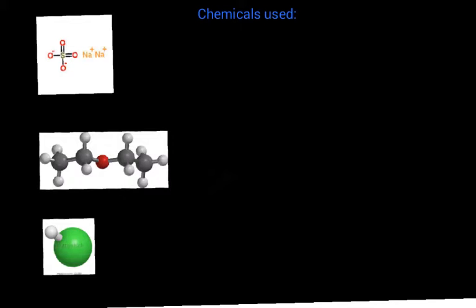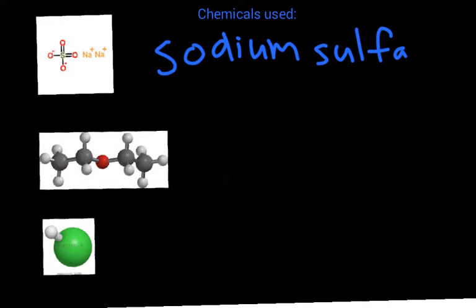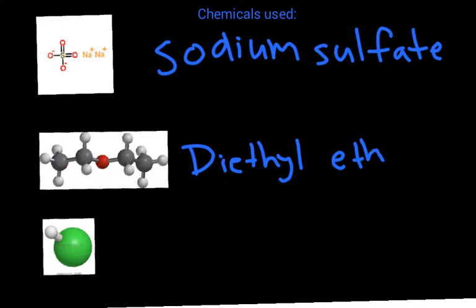The chemicals used in this experiment were sodium sulfate, diethyl ether, and hydrochloric acid.